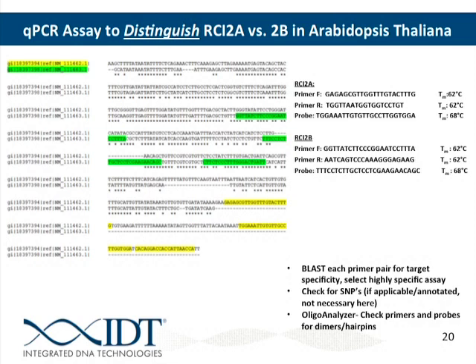And so it does. It gives us a couple, 3 different assays to choose from. And so now from here, we look at these one by one and line them up on our Clustal alignment to make sure that the probe does encompass that region as we intended.